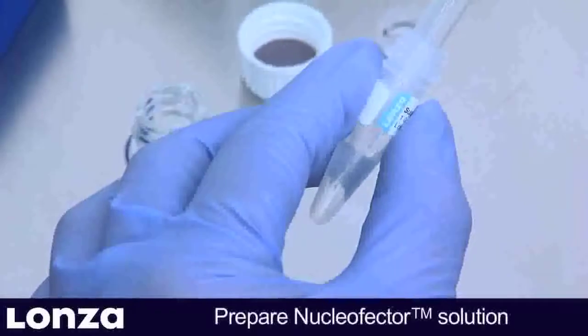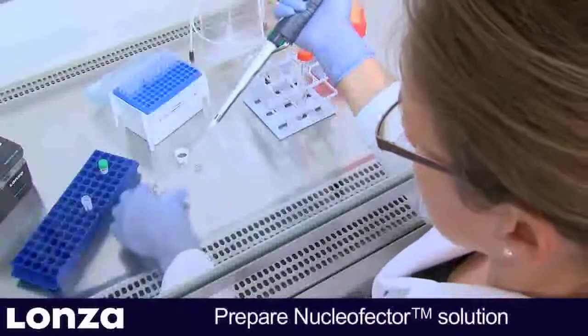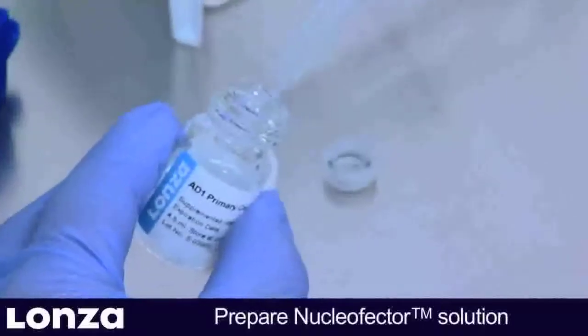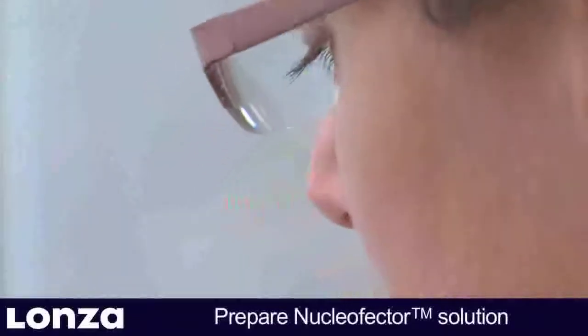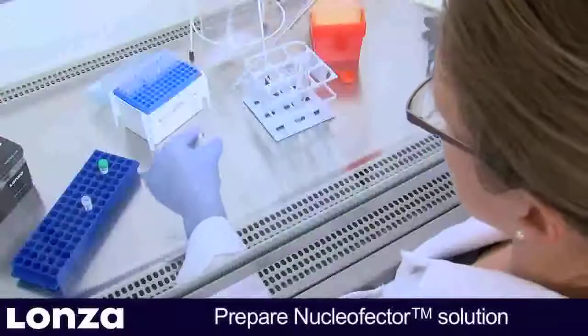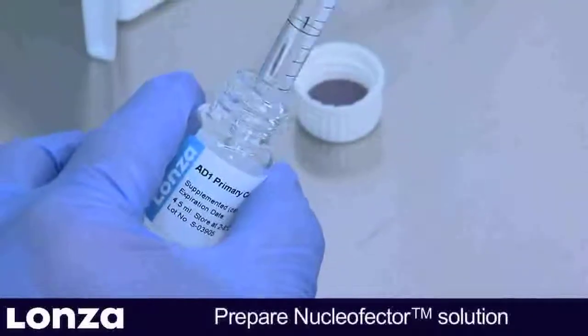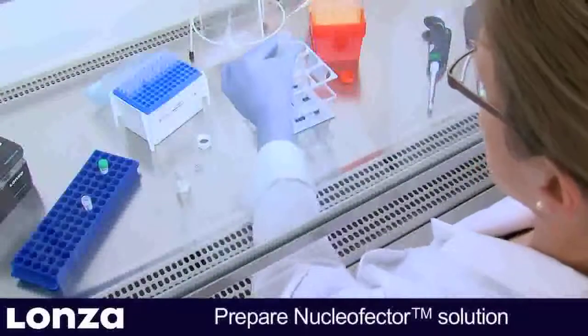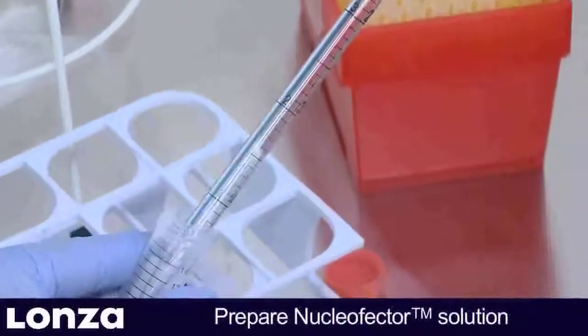Now add the entire supplement to the Nucleaffector solution and mix well. Once the Nucleaffector supplement is added to the Nucleaffector solution, it is stable for 3 months at 4 degrees Celsius. Transfer the supplemented solution to a fresh tube.